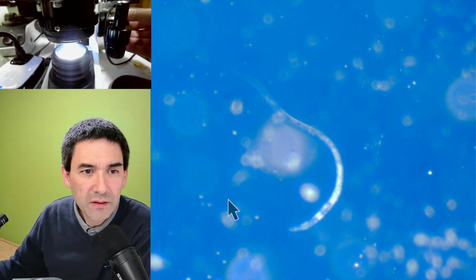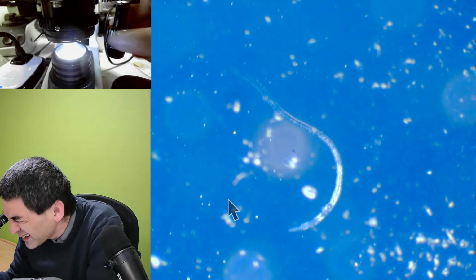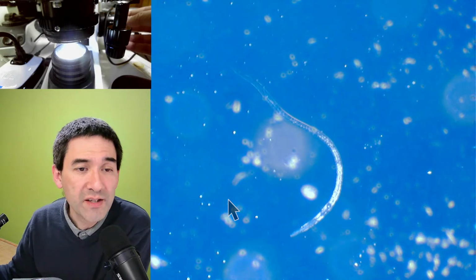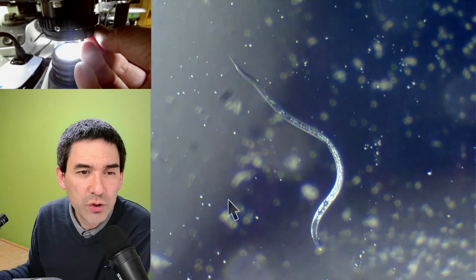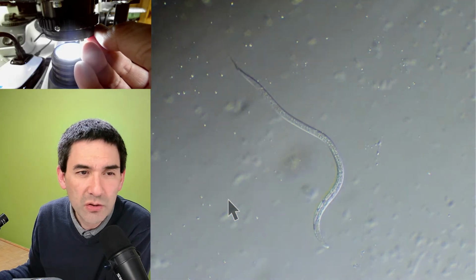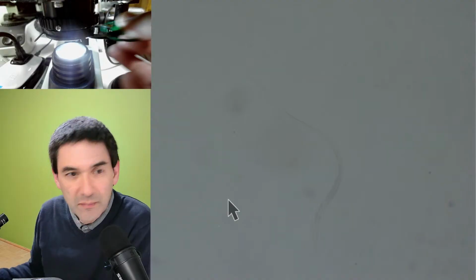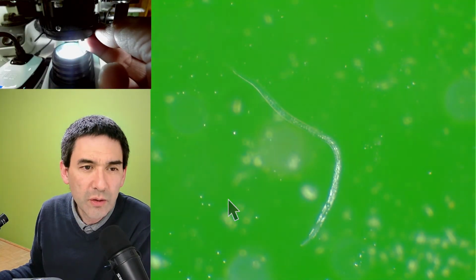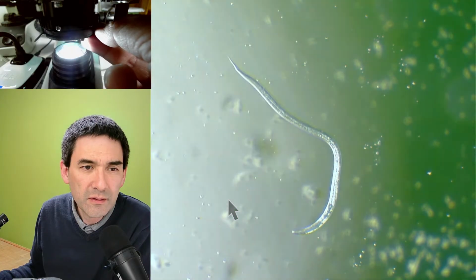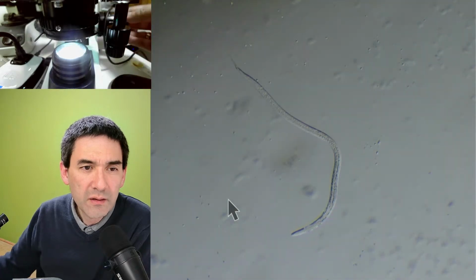Yeah, see, that's the blue filter now. Okay. Again, under the microscope directly it looks much nicer than here on camera. But I guess you get the idea. Let's see, if I shift it out again, then I'm getting again into the oblique illumination. Let's try green. Yeah, green doesn't quite work. Maybe now a little bit. Then when I shift it out, I'm again in this oblique.